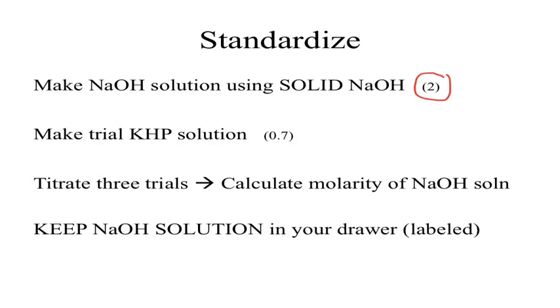So you'll make your 500 ml solution. Make sure those pellets get entirely dissolved. You will probably notice that the container gets hot. Why would it get hot? It's an acid-base reaction. Acid-base reactions are exothermic. Is that what you said? Yeah. Oh, I heard isocaloric. Exothermic. Yeah, it is an exothermic reaction. Good job.